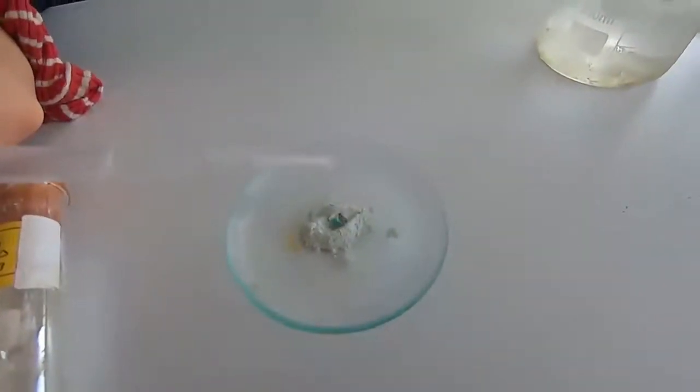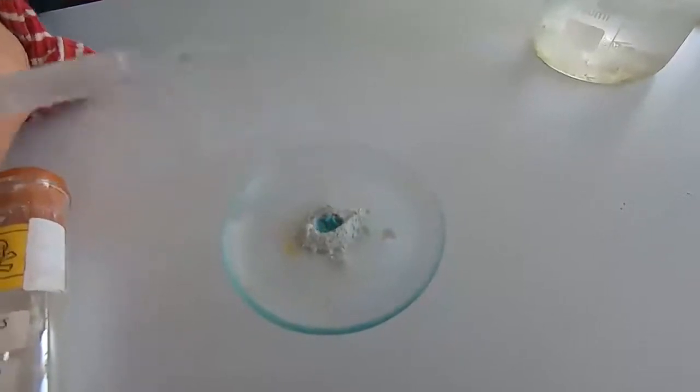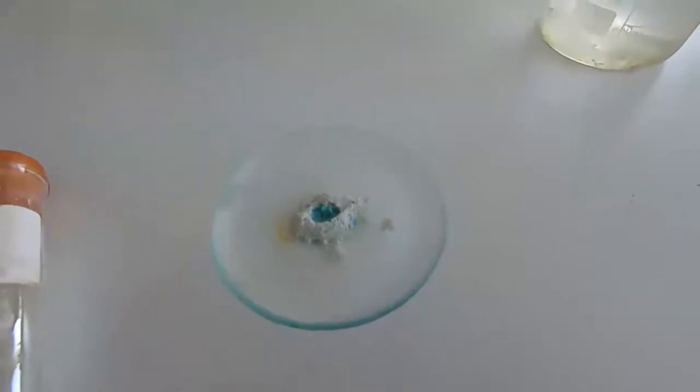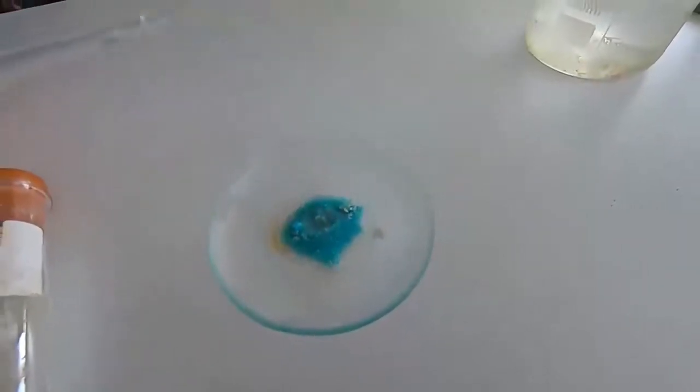And as you can see, it turns blue. Anhydrous copper sulphate turning blue proves that the colourless liquid we're obtaining is water, or at least contains water.